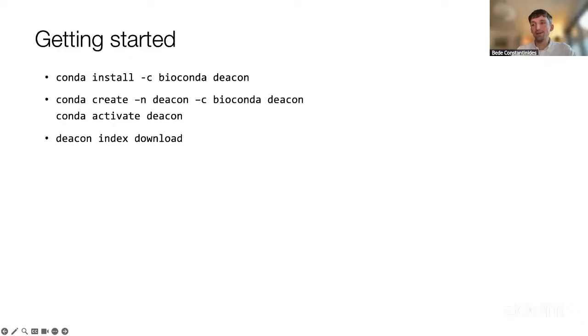So it depends. If you need maximum sensitivity and you don't mind getting things that aren't quite your target, then you should use alignment. If you want to be a little bit more selective at the cost of maybe missing things with one mutation in them, then Deacon. To be clear, Deacon searches by default for 31-mers, k-mers of length 31, across your sequence, and not every one has to match. So you choose the threshold. It has a default of 2 and 1%, both of which have to be satisfied, but you can change those to make it more or less sensitive.